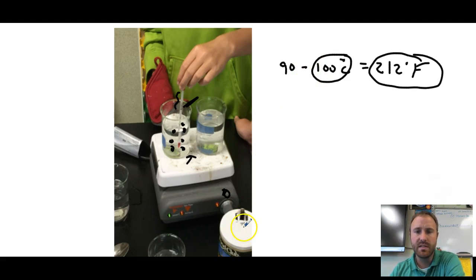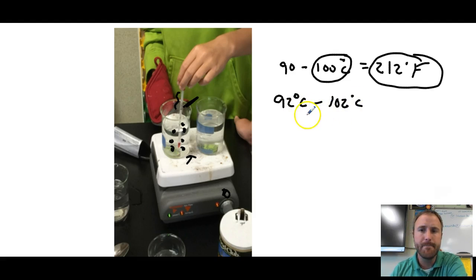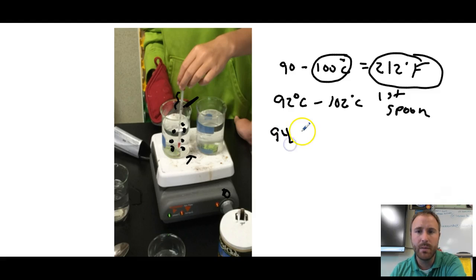The next thing you needed to do was to take a spoonful of salt and add it to the beaker. And when you did this, it probably increased the temperature somewhere in the neighborhood of 92 degrees Celsius up to maybe 102 degrees Celsius. And so you see that there was definitely, this is for the first spoonful, definitely an increase. And then when you added the second spoonful, it probably went up somewhere around 2 more degrees. So now maybe it was up to 104 degrees Celsius for the second spoonful.